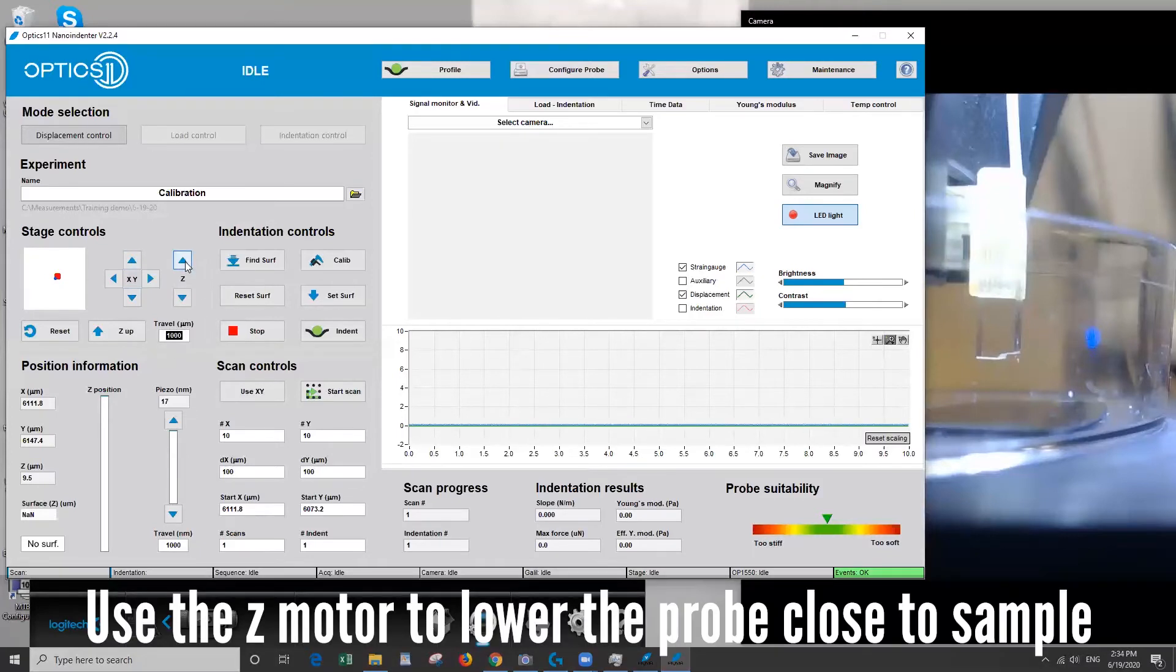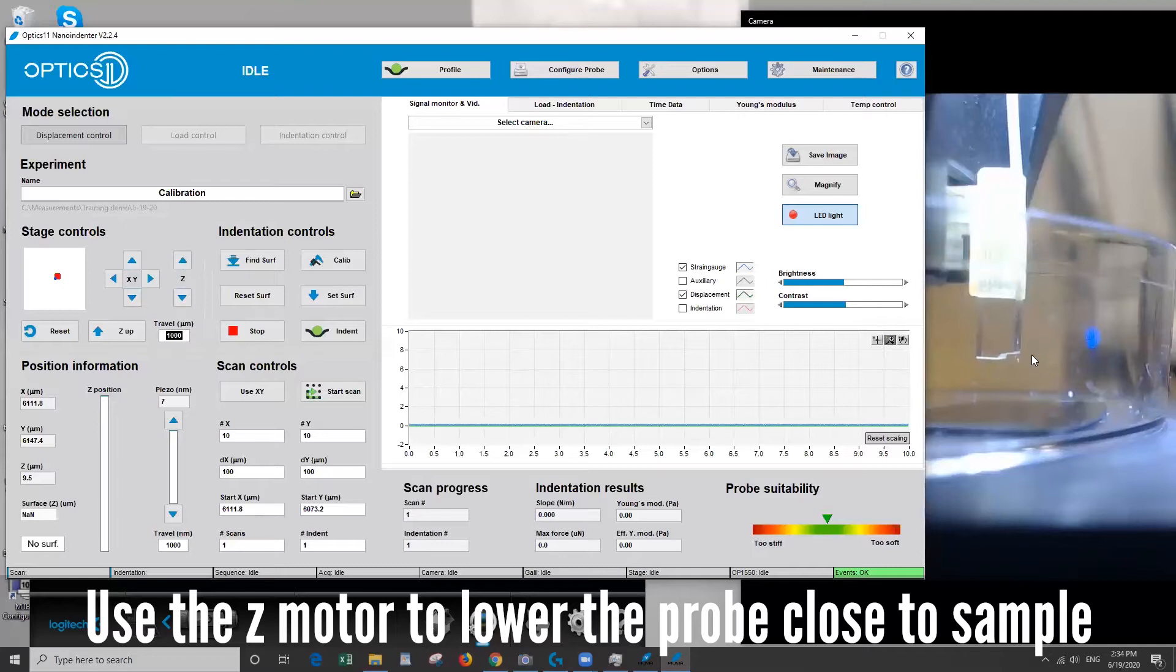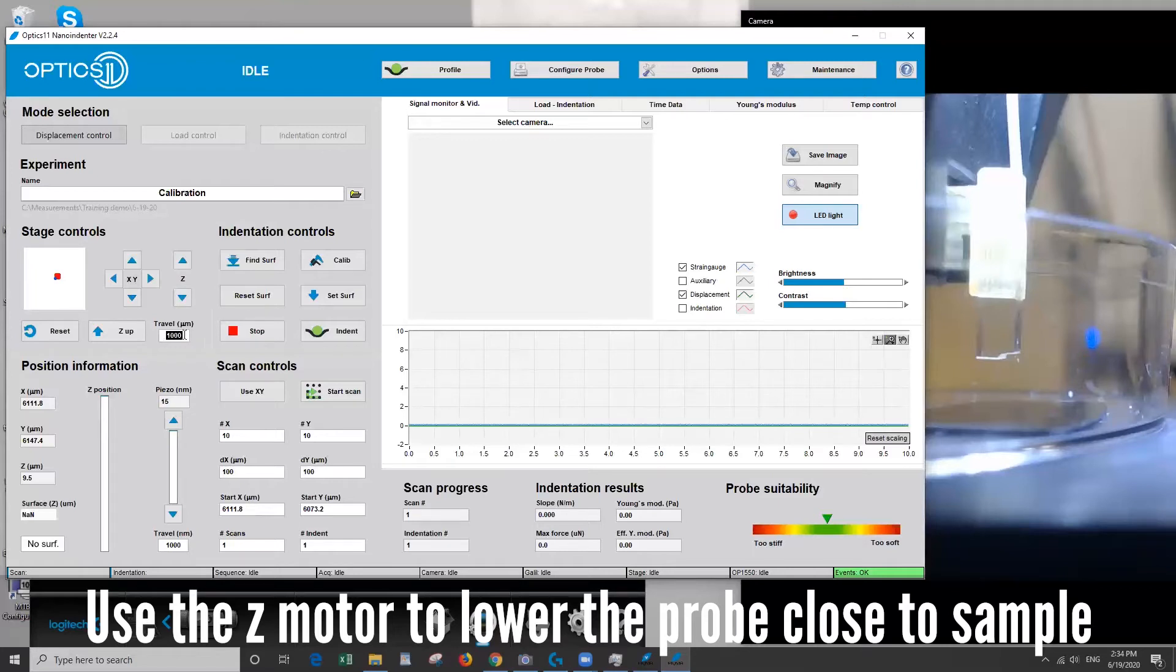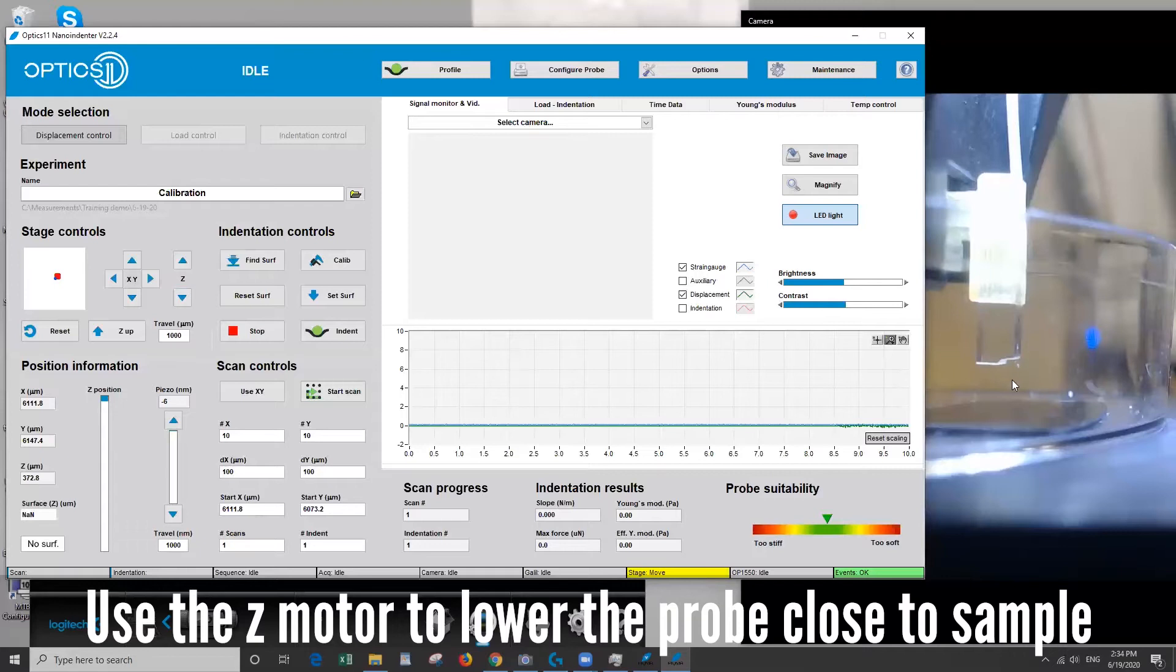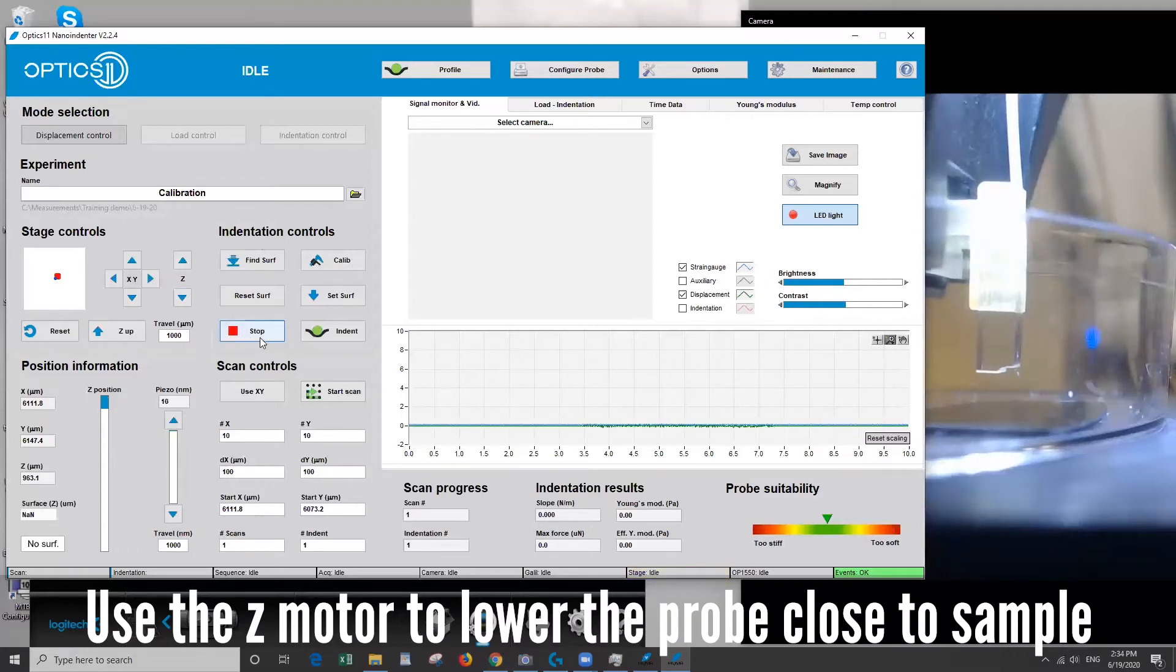Similarly the z also raises and lowers the probe so this is the one we're going to use first. Since we are pretty high up above the surface of the sample we can start with a thousand and feel pretty safe that we won't crash. But we'll keep an eye here and if I think I'm going to crash because I set the number too far we can hit stop.